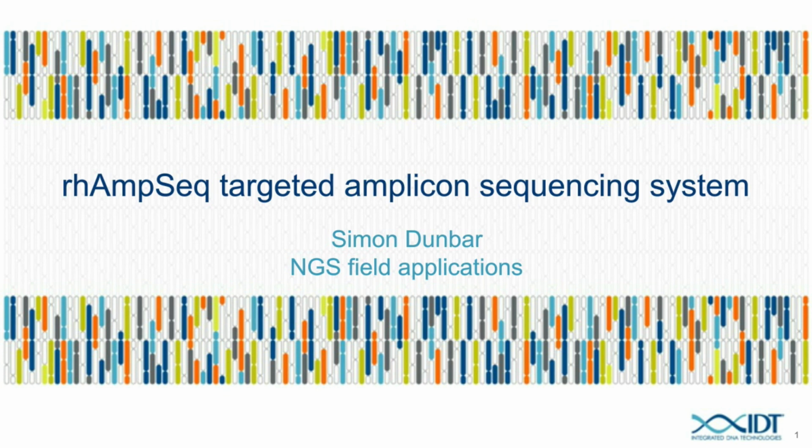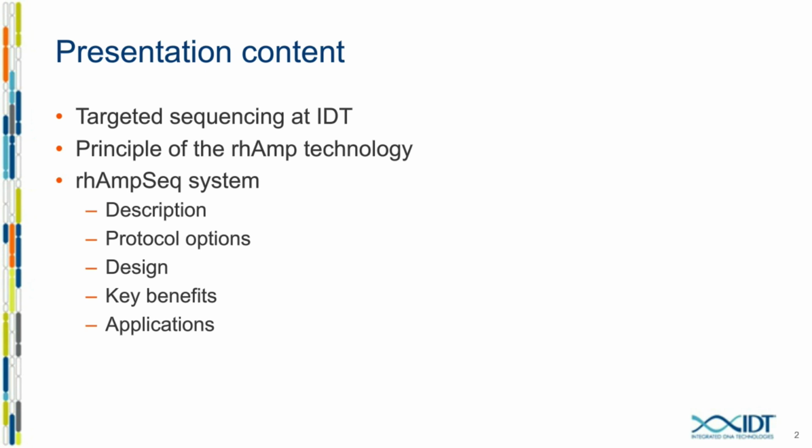Thank you, Ginny. G'day everyone, thanks for dialing in to today's presentation on rhAmpSeq targeted amplicon sequencing. During today's presentation, we will cover targeted sequencing at IDT and the underlying chemistry of rhAMP technology. Then we'll look in detail at the rhAmpSeq system, cover some protocol options, design, key benefits, and finally we'll finish off with some example data and applications. This should only last around 20 to 25 minutes.